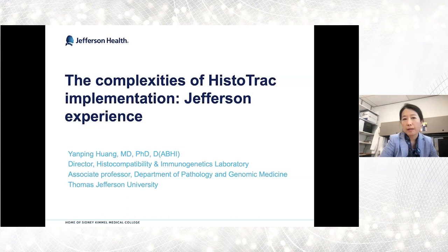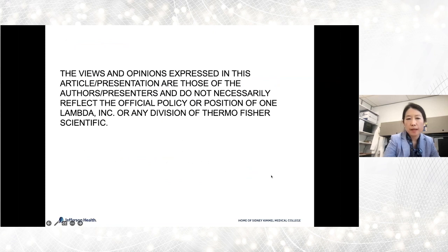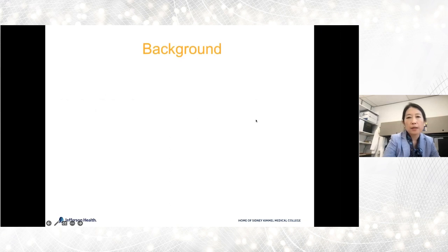It's unique because it's really a complex process. This is just my disclaimer. What I'm saying or showing is nothing that Lambda or any official wants me to say. So I just want to give you a background.